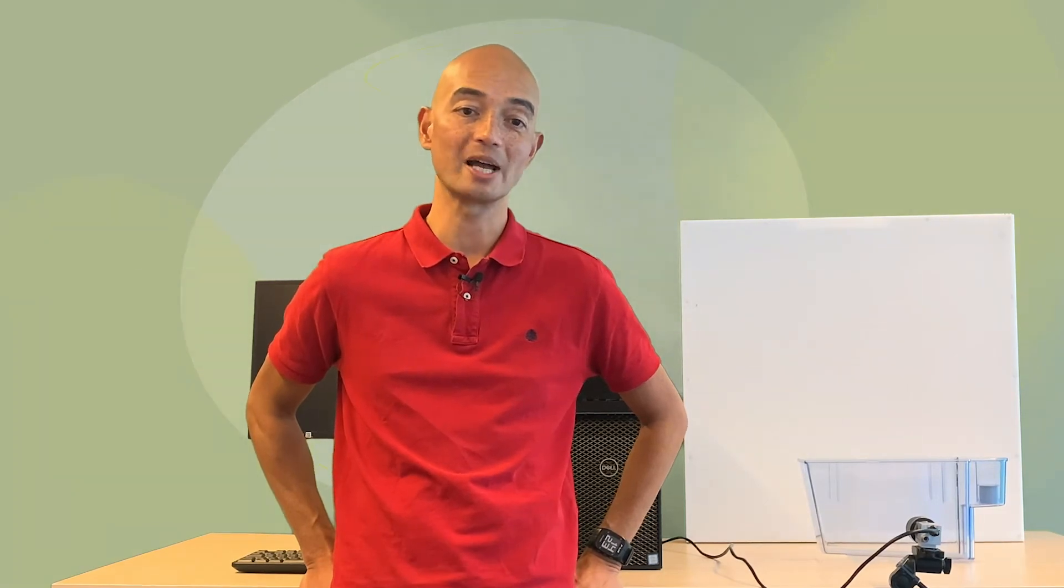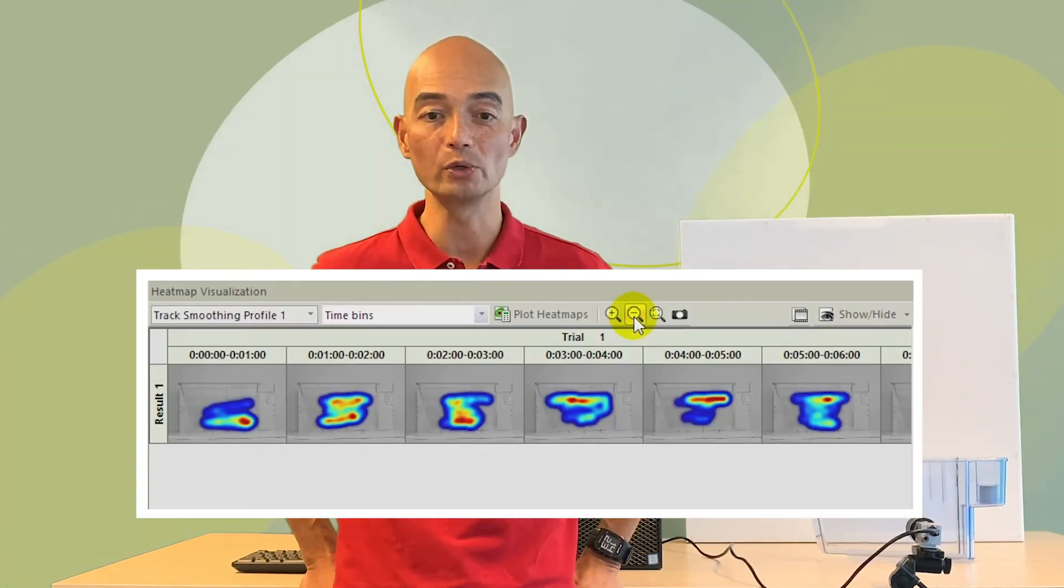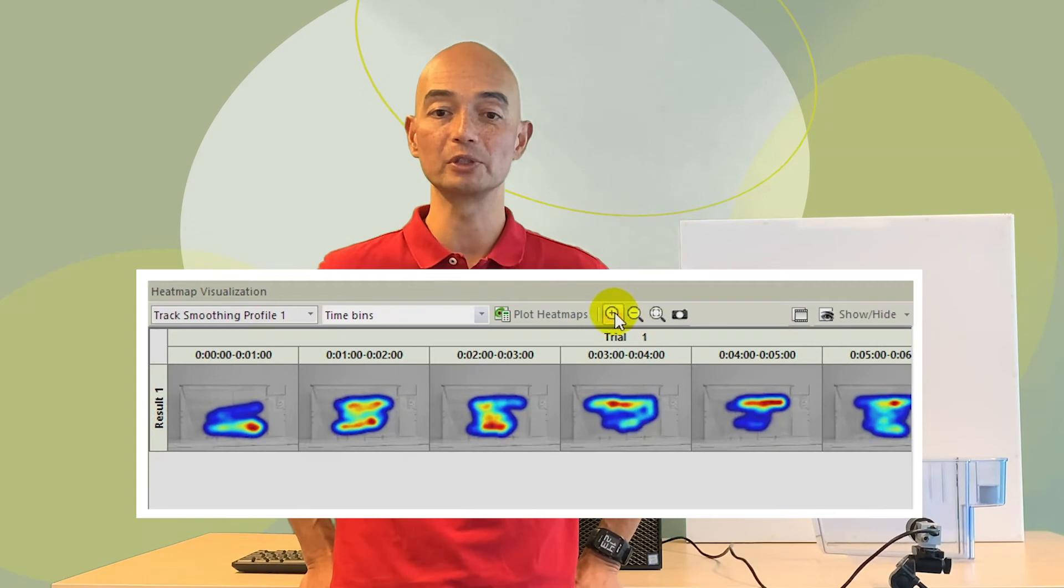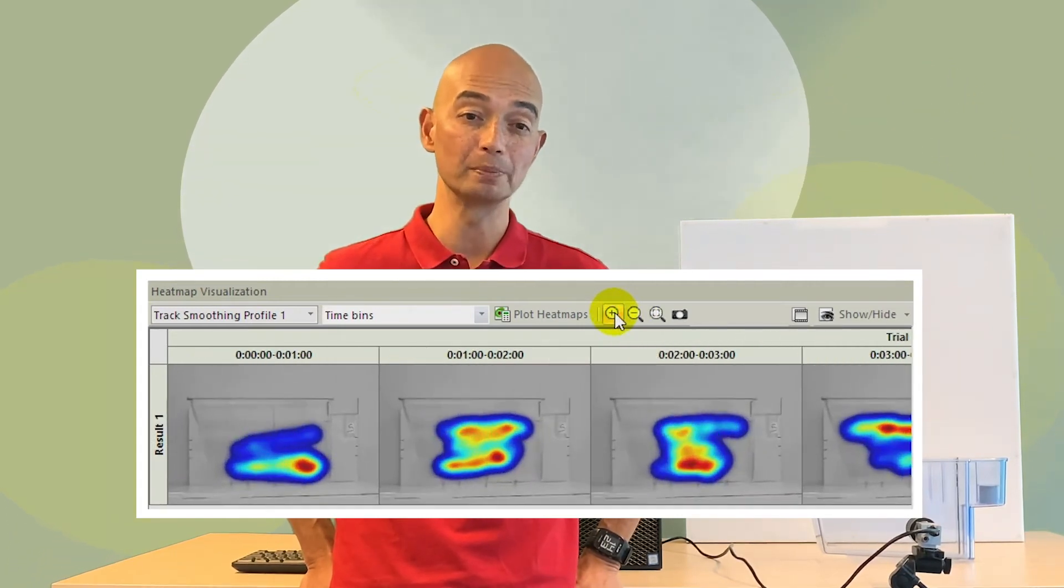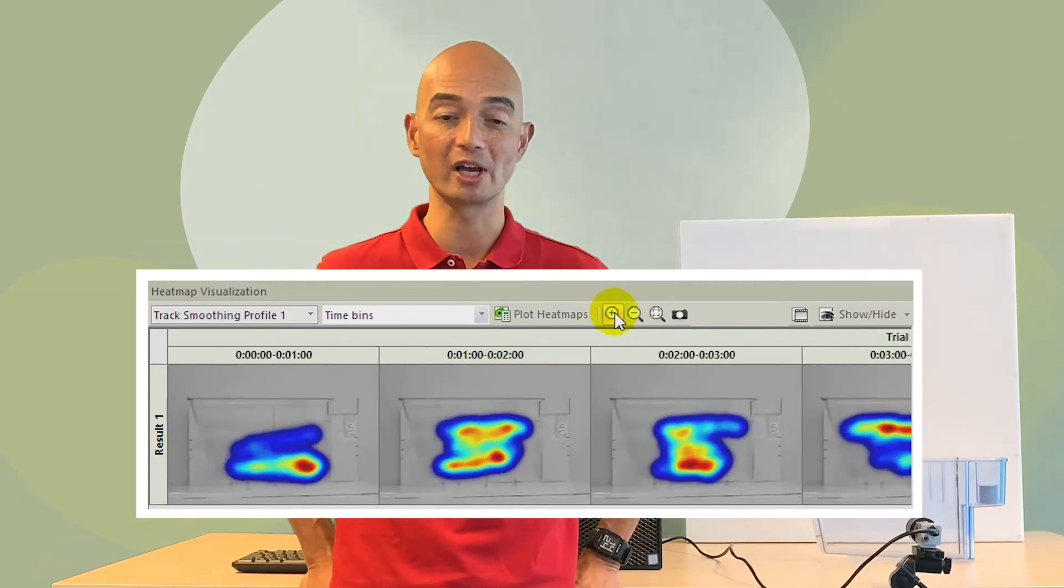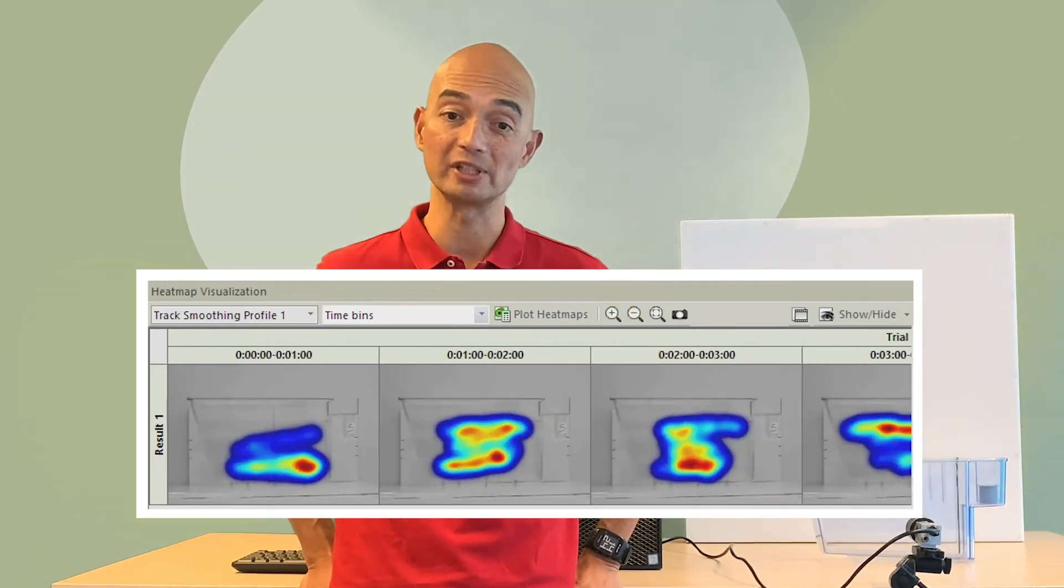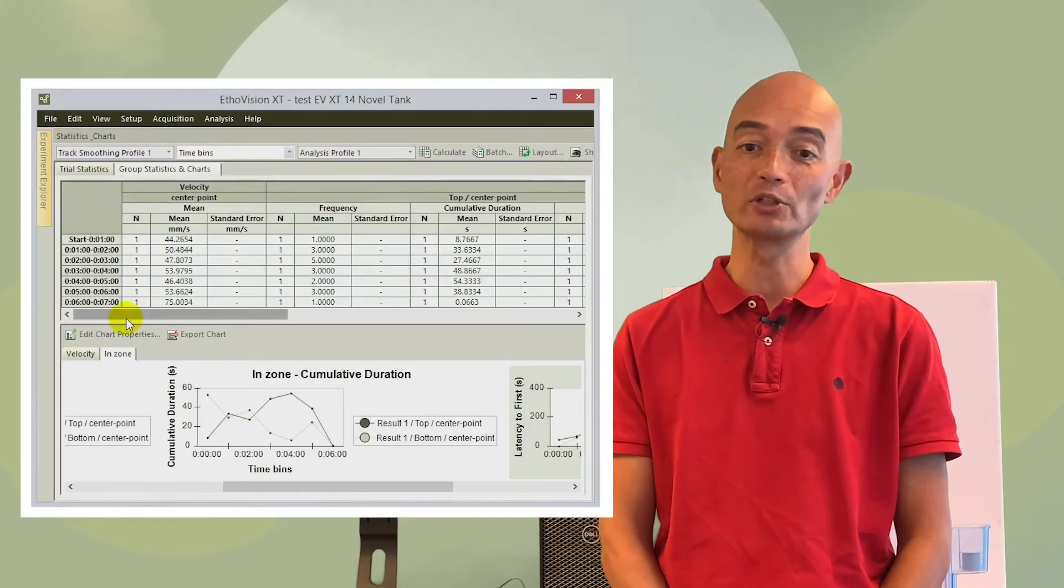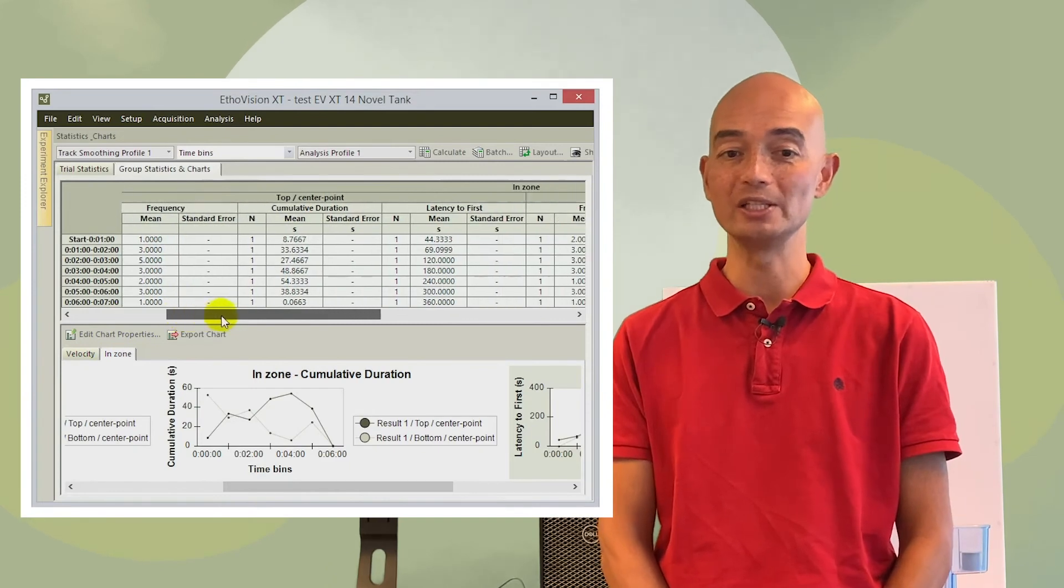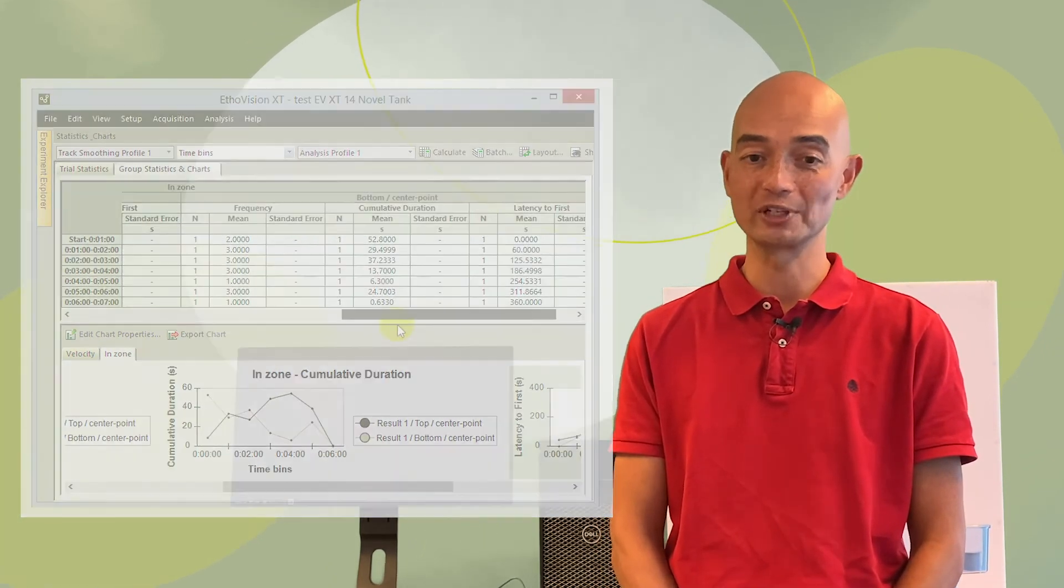Another advantage of using EthoVision XT video tracking is the selection and visualisation of data. For example, heatmaps intuitively show you how an individual zebrafish or a treatment group divides its time over the bottom and top half of the tank. Of course, EthoVision XT also shows you the stats and allows you to export these or the raw data for further analysis.